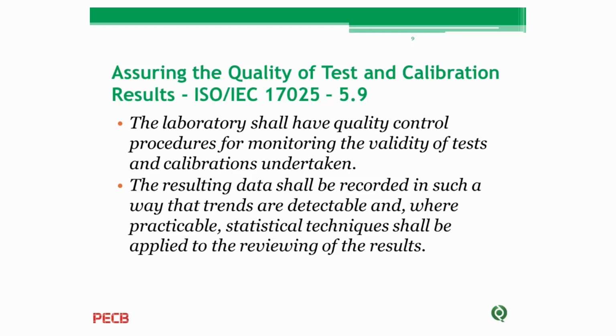A quality control chart is a graphical means that enables us to monitor the changes in our test results in a period of time to see how the changes are. Are these changes limited to our acceptable range, or are they out of it? Has a systematic error happened, or a random error? We will go through these systematic and random errors to see what they mean.